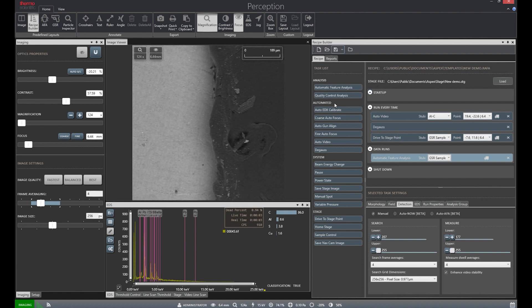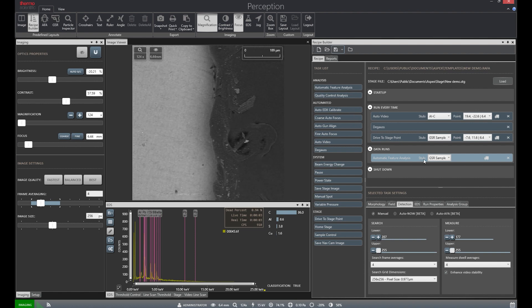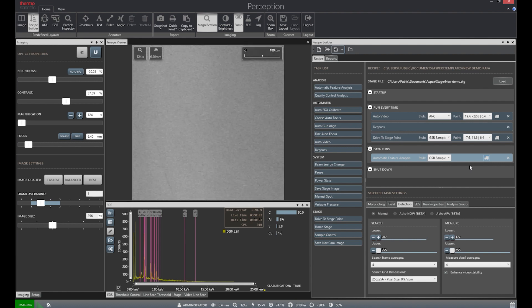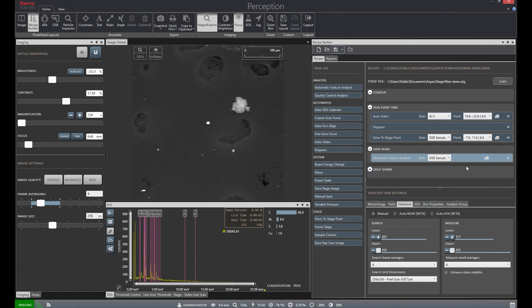We'll use a basic recipe I have set up that will quickly move to our area of interest and acquire information on identified particles. There are multiple other functions available to our users such as EDS calibration, adjusting accelerating voltage, and beam intensity, and degaussing the column.